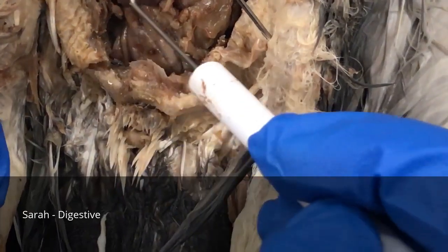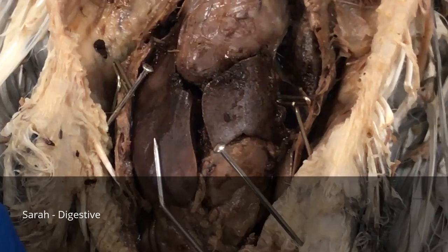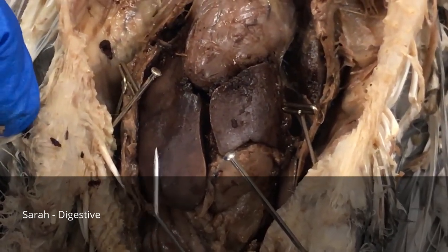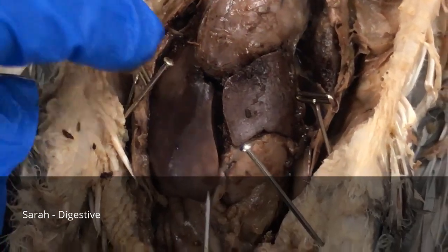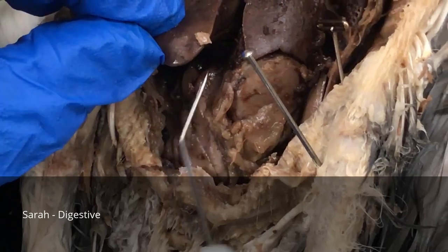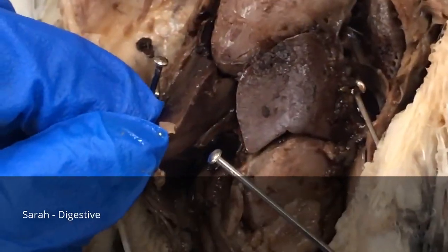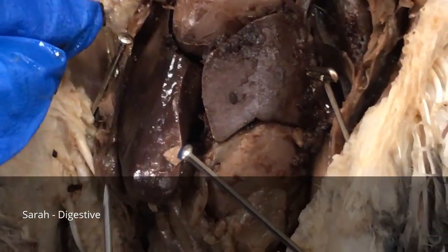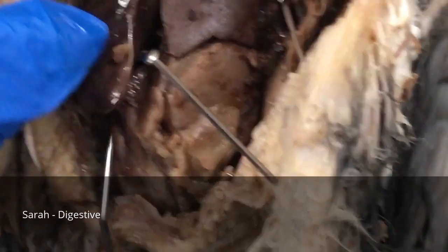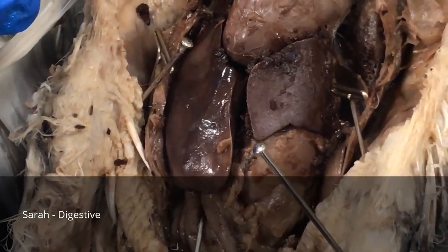And then over here we have the liver. The liver is an accessory structure, and the intestines receive bile that is made in the liver right here. And in the liver there is a gallbladder, and the gallbladder stores the bile, which goes into the intestines, which helps with nutrient absorption.